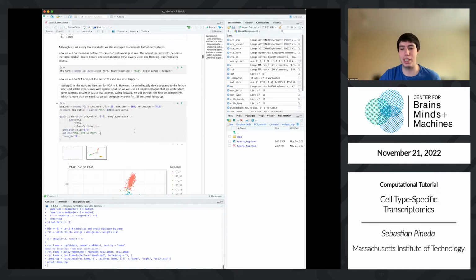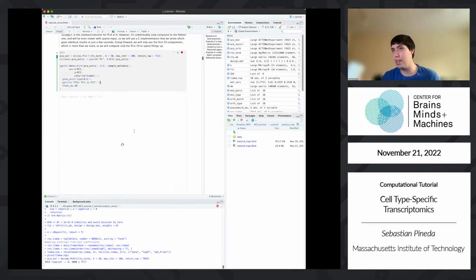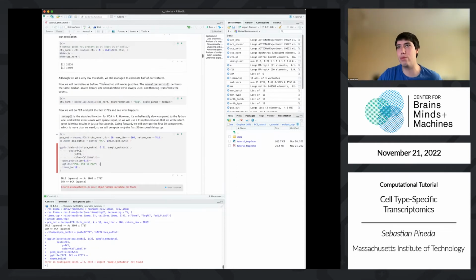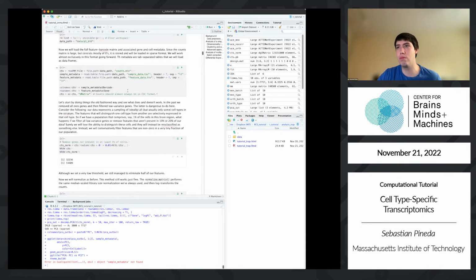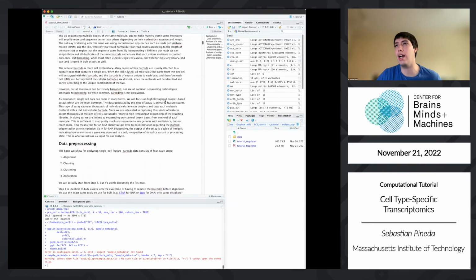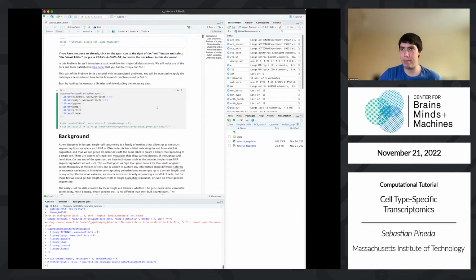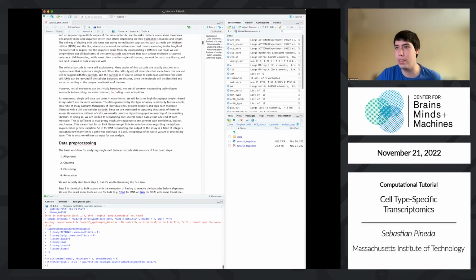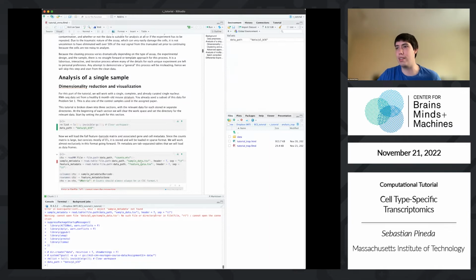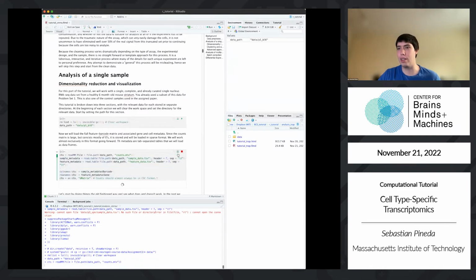So I'm just going to plot PCA. I'm just going to plot the first 2 components, and we'll see what we get. Oops. We didn't actually read it in all of these. All right. Okay. I tried running this beforehand, but I don't think it actually ran all the way through. So I'll just do that. This will take about just a second to reload the data.